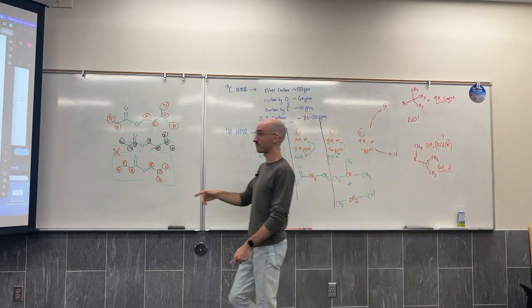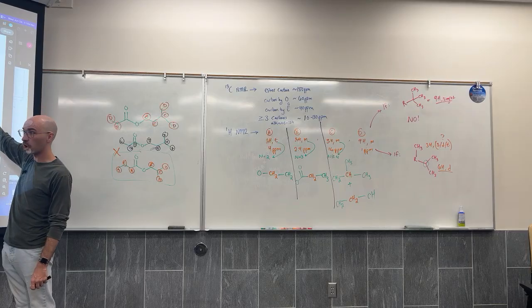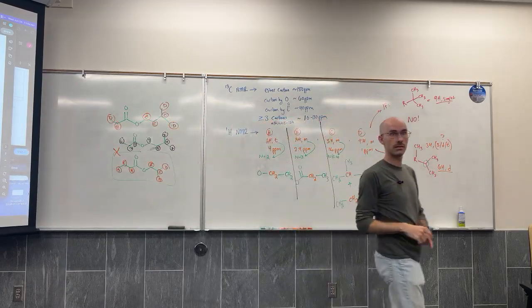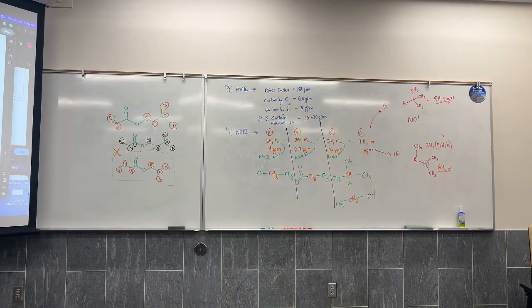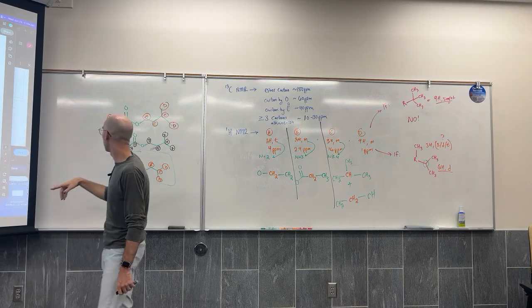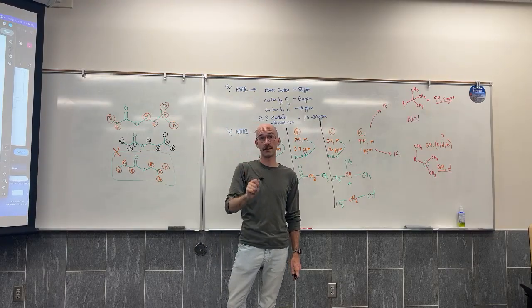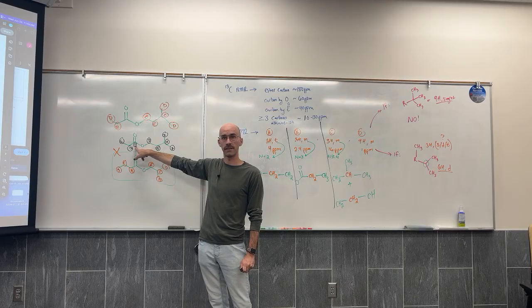But you wouldn't know that any of these signals represents twice as many carbons as the others, because the height means nothing and the area here is not useful. Sorry, what were those numbers? If I had labeled this carbon NMR as signals 1 through 7 from left to right, these are where those signals would show up. These are the carbons those signals would come from. The carbons, not the hydrogens, because there are famously no hydrogens at that ester carbon.